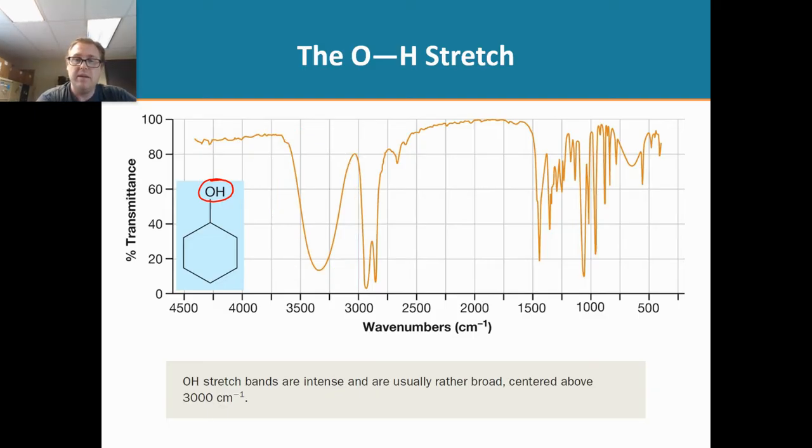Now the next thing I do is I look around 1700. I always do that when I see a spectrum. Why am I looking there? Because that is indicative of a carbonyl, and I don't have a carbonyl. So the carbonyl is another one that's really easy to spot.